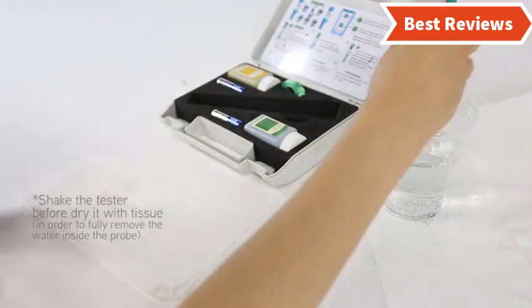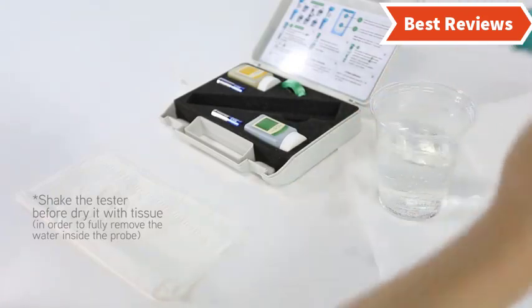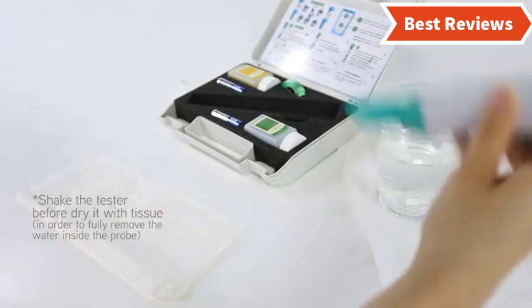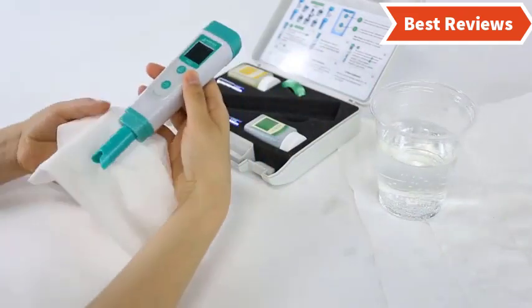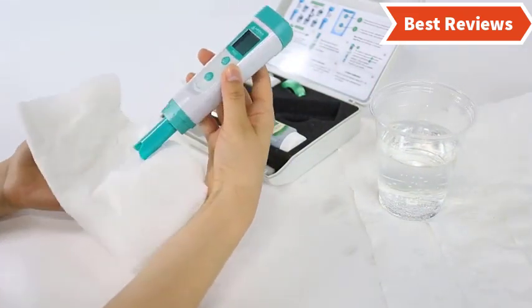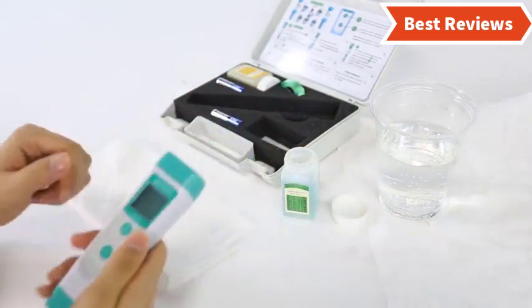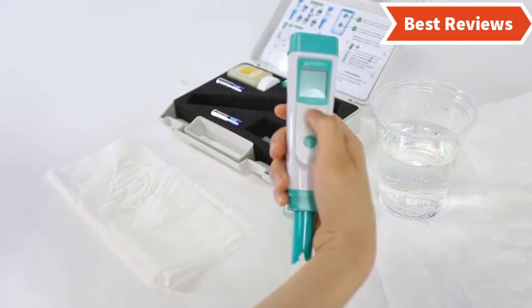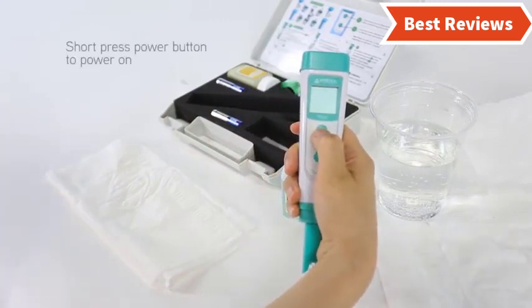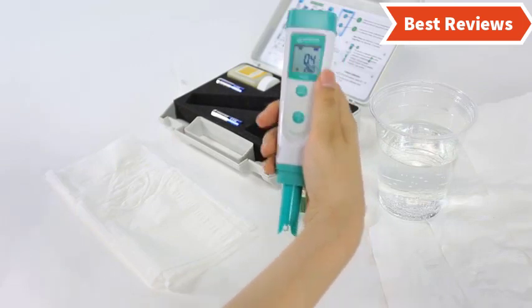Choosing the best pH meter can be difficult as there are a lot of them in the market. In this video we are going to show you the top 5 pH meters in the marketplace. We have selected them based on their quality, performance, and price, and we've done sufficient research to find them. If you are trying to find out which pH meter is the best, this video is for you.